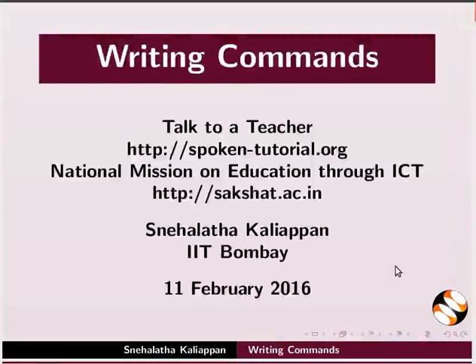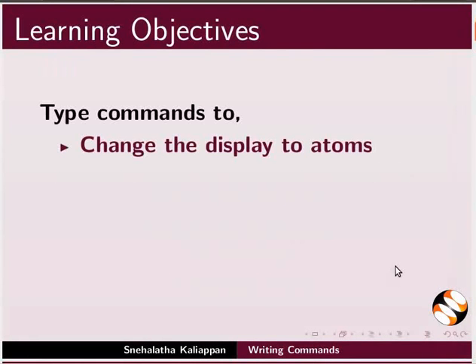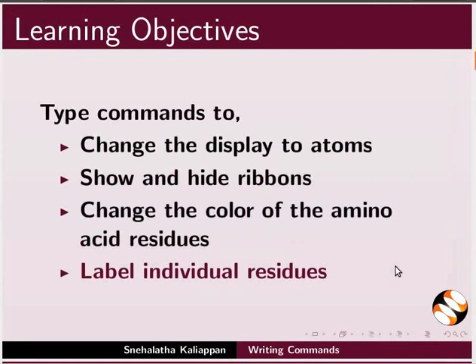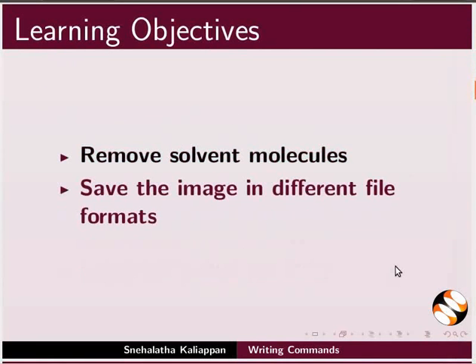Welcome to this tutorial on writing commands in Chimera. In this tutorial, we will type commands to change the display to atoms, show and hide ribbons, change the color of the amino acid residues, label individual residues, remove solvent molecules, and save the image in different file formats.